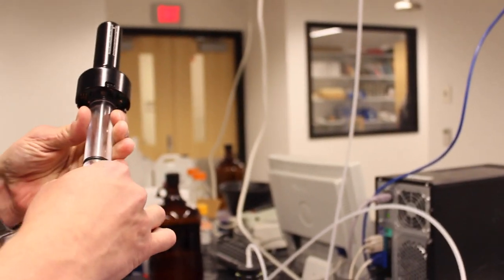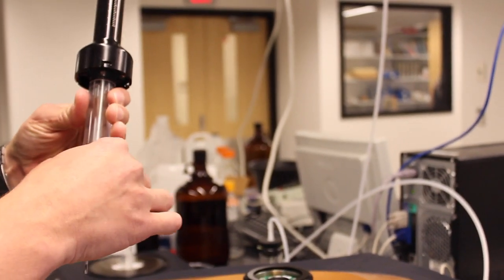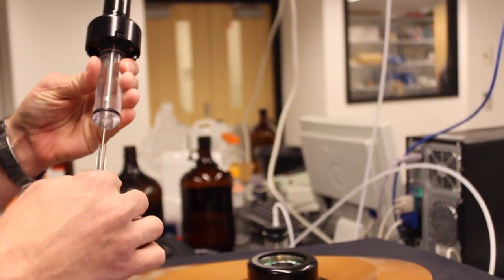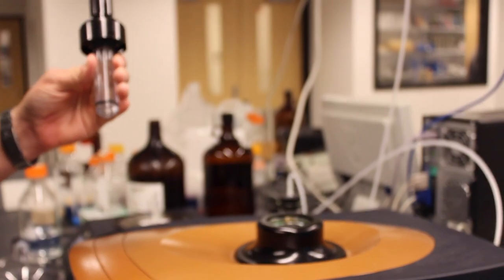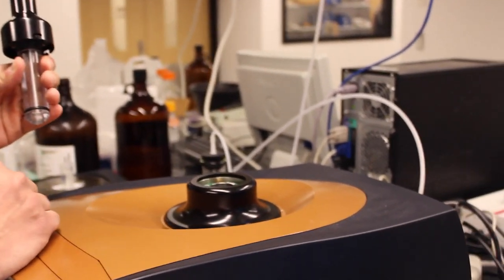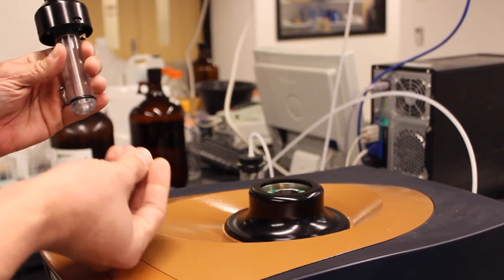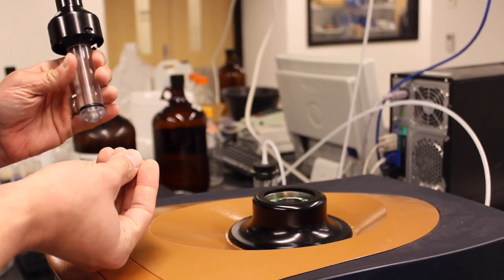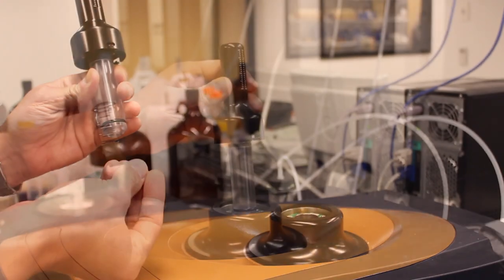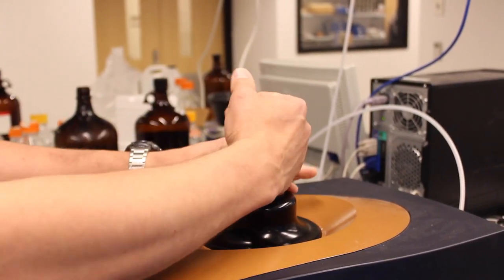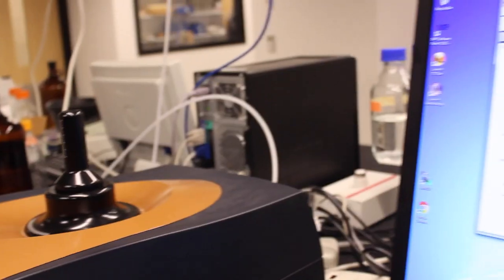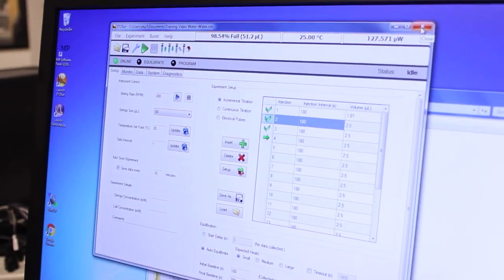When you're finished with your experiment please be sure to remove the syringe from the burette thoroughly clean and dry the syringe as well as clean and dry the cell. Leave the cell filled with air only so that it does not cause problems for the next user. When the cell is clean and dry you can reinstall the burette handle with no syringe installed.